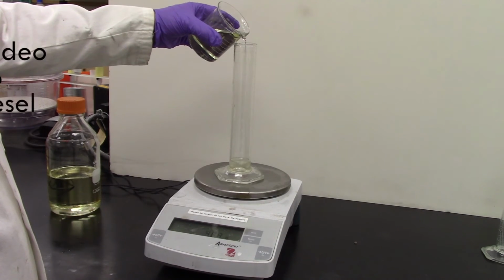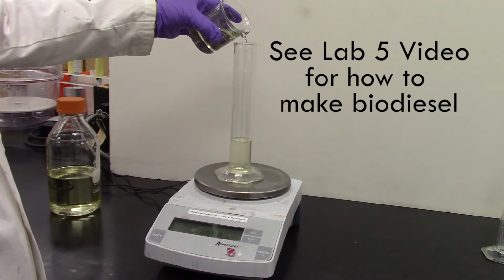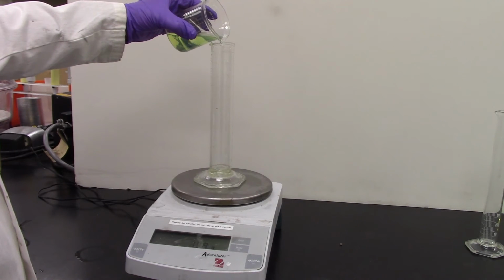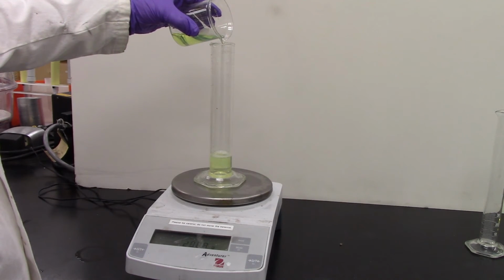Then pour calculated mass of biodiesel produced from 100 grams of vegetable oil in a separate measuring cylinder using a dropper and a weighing scale. Finally, pour 50 grams of petroleum diesel in the third measuring cylinder using a dropper and a weighing scale.